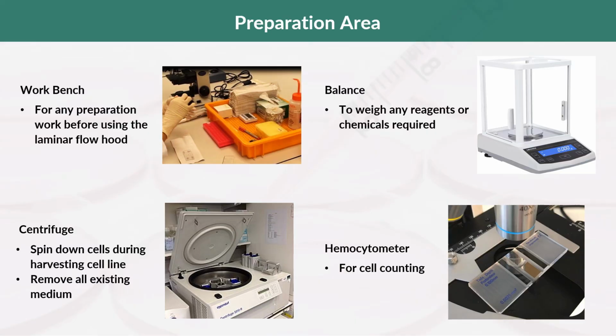And you have a centrifuge. So what is this centrifuge? Centrifuge is also one key piece of equipment where sometimes your cell suspension requires centrifugation because you want to increase the concentration of the cells, or you want to wash off some reagents that you have added in your cell culture. So ideally, a centrifuge is always seated on its own table or bench, far away from other equipment, because you do not want the vibration coming from the centrifuge to affect all the other potentially sensitive equipment.